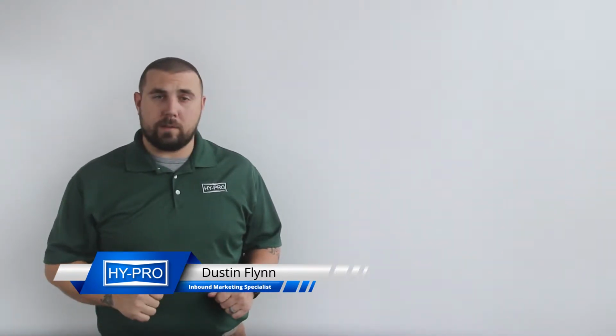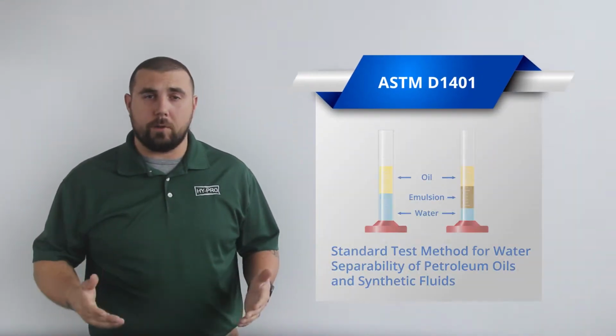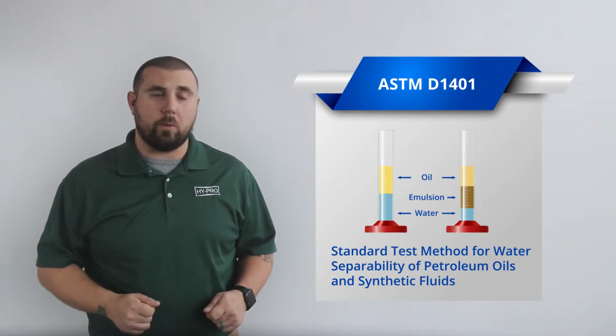In our last video, we discussed demulsibility and its characteristics in turbine oil. Today, we're going to cover what demulsibility testing of turbine oil looks like. The industry standard test for demulsibility level of turbine oil is ASTM D1401.